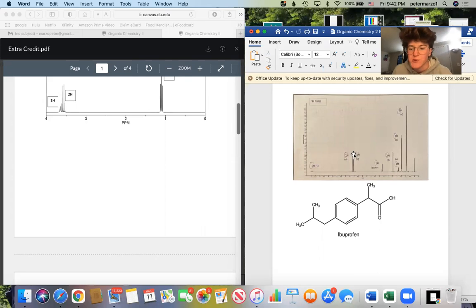In addition to these partial structures, we also know that there's a CH2 group in this molecule, and this is attached to the CH group that is involved in the isopropyl group due to their corresponding signal information matching up with each other, and them having similar ppms or locations on the spectrum. After looking at all these partial structures, in addition to the para substitution on the aromatic group, you can include all of these structures and begin looking backwards at the proton NMR to see if these signals match up and to see if your structure is drawn correctly.